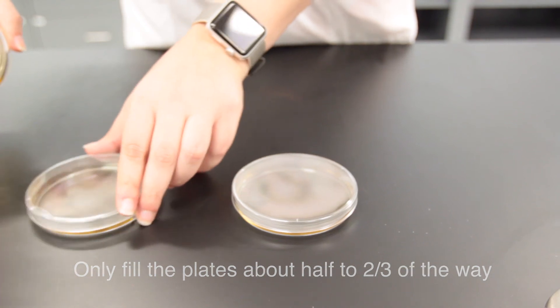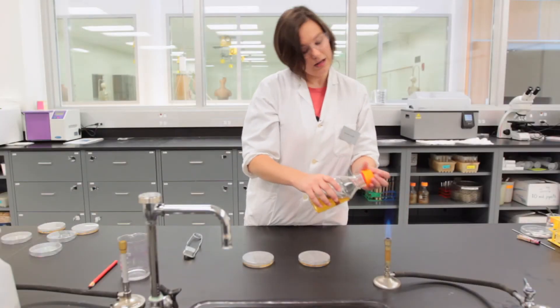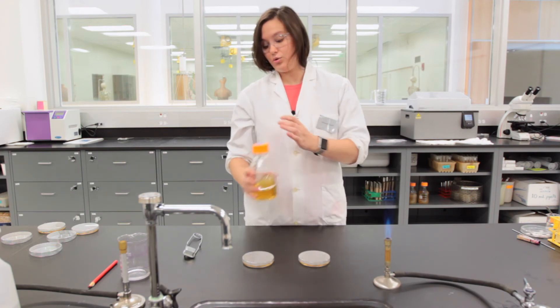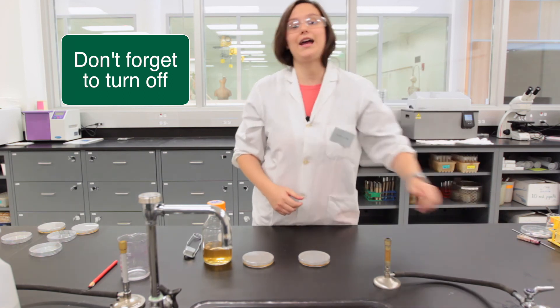Once you're done pouring your plates, you pass the opening of the bottle through the flame twice again and recap. Make sure that as soon as you are done using the flame you turn it off, so as to avoid any accidental fires.